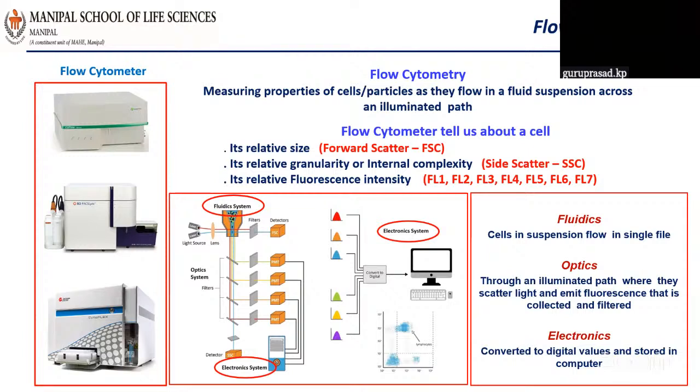for the analysis. When you have a single cell suspension, you have to suspend the cells in an isotonic solution so that the cells retain their shape and structure. Generally, people use tissue culture media or a PBS buffer or any such isotonic solution to suspend the cells. And one important thing, they have to be suspended as single cell entities.